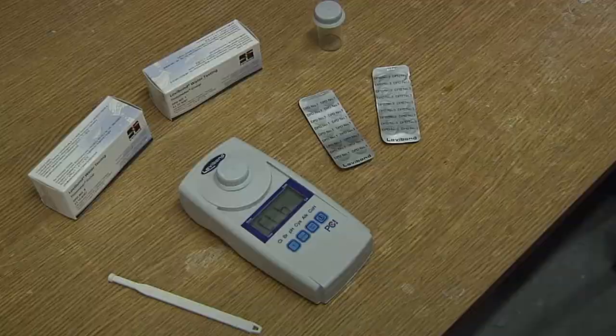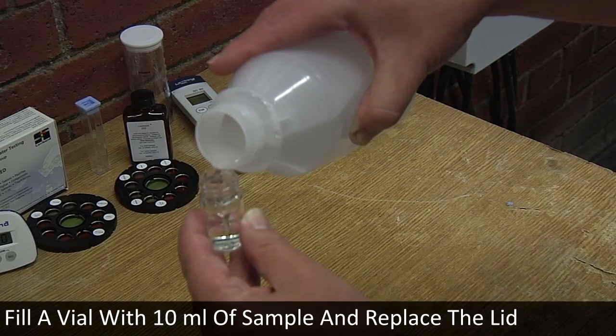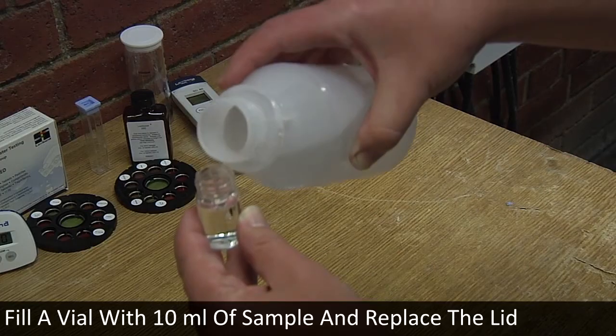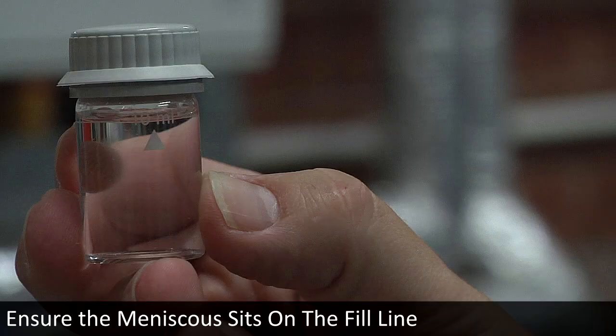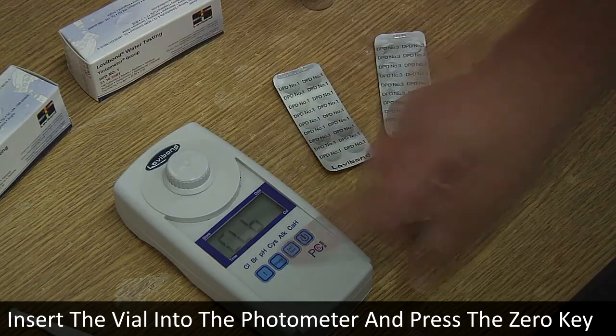Fill a clean dry photometer vial with exactly 10 millilitres of sample and replace the lid. Ensure the meniscus sits on the fill line. Insert the vial correctly into the photometer and press the zero key.